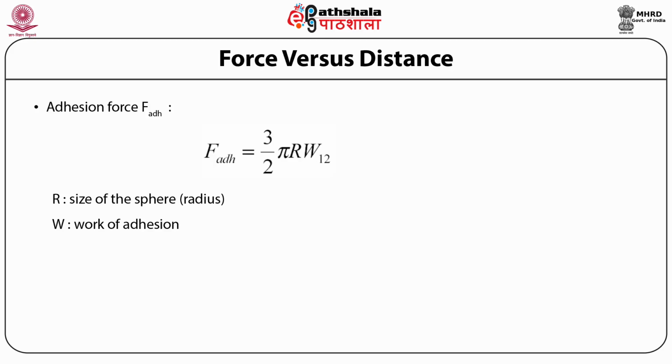Adhesion force, which is indicated as F adhesion, is given by a mathematical relationship. F adhesion is equal to 3/2 πRW, where R is the sphere radius and W is the work of adhesion.